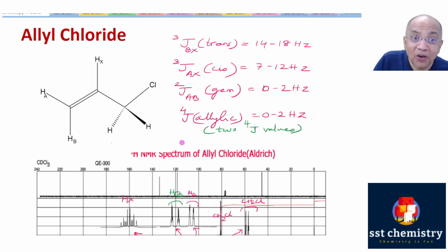So all these are very fortunate when this is a rigid system, a cyclic system. These 2 are non-equivalent in a rigid system. Then these will couple slightly differently, and that coupling can go up to 3 in the strained system, this allylic coupling. And if the dihedral angle is 90, it is still more. We're not going to discuss the J4 coupling in detail.